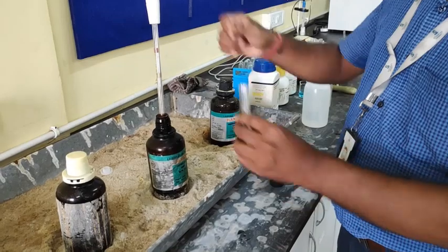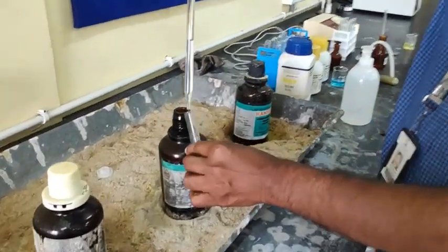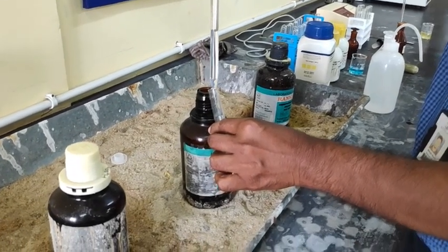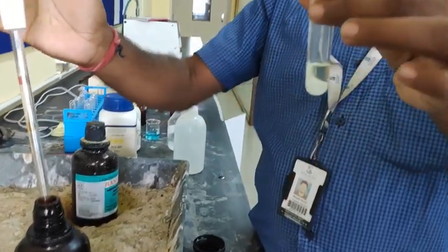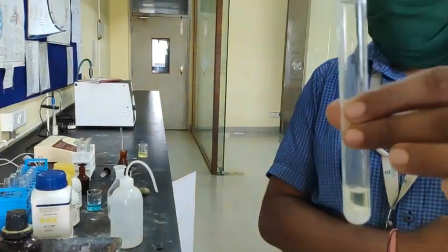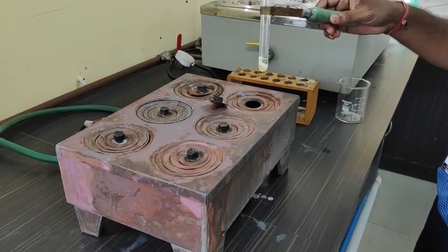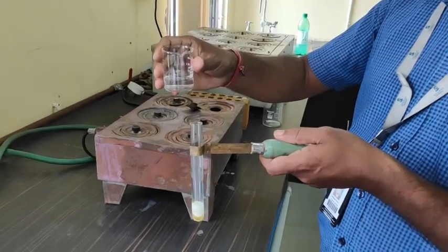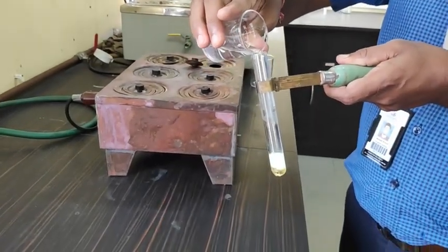First thing first, we need to add some amount of nitric acid. So some nitric acid is now being added. Okay, if we see it properly, there is already a precipitation. Now let's see what happens after the boiling process. Now we are putting it into the water bath for boiling. Now after the boiling process is over, we are adding some amount of sodium hydroxide.